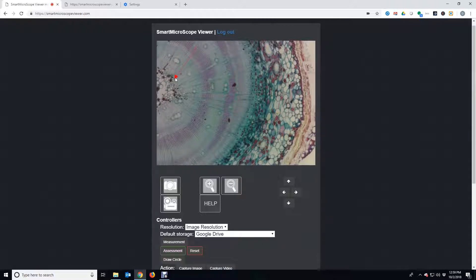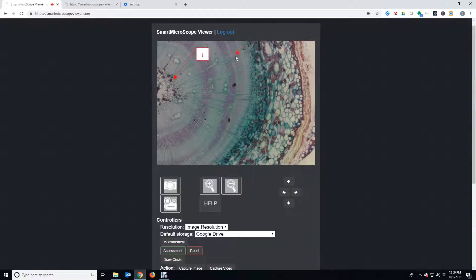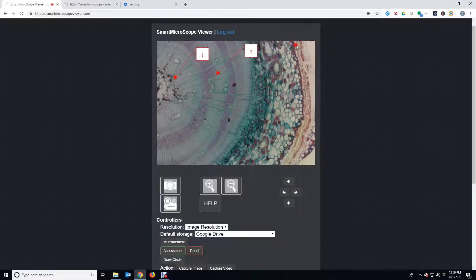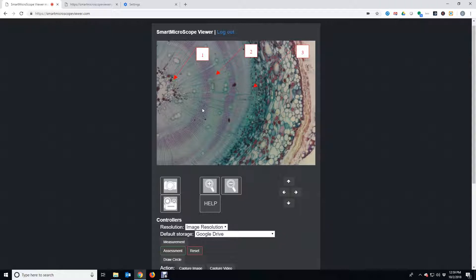The Smart Microscope Management tool allows the teacher to quickly create a quiz to determine if students have learned the concepts. Simply click and drag to an area on the image and an arrow and numbered box are drawn.